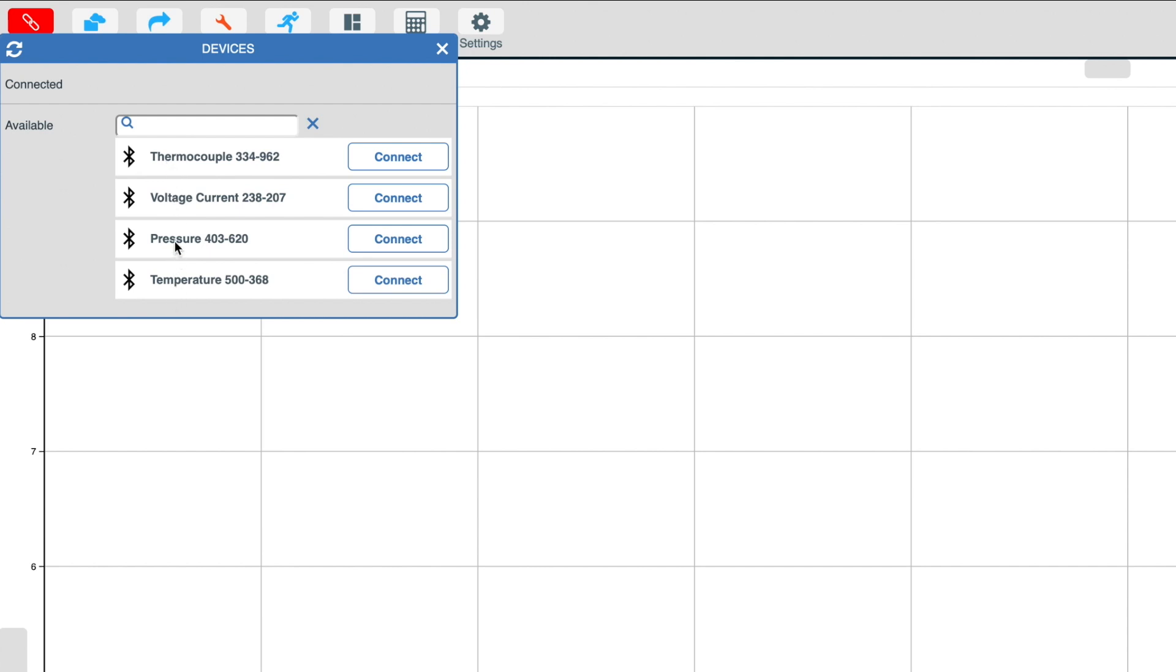In some cases, you may have a large number of devices available. Within the EasySense 2 software, we can easily filter all of the available devices.